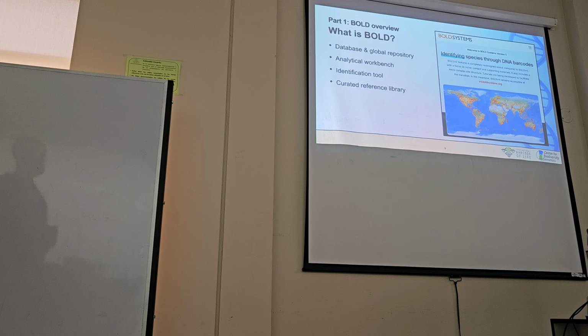And so for this course, the data that Robin and I worked with when we were at Los Amigos in Madre de Dios, you will download that data for the course that we made public for this course. And you also can put sequences on GenBank, which is a bigger non-barcode-specific sequence repository.